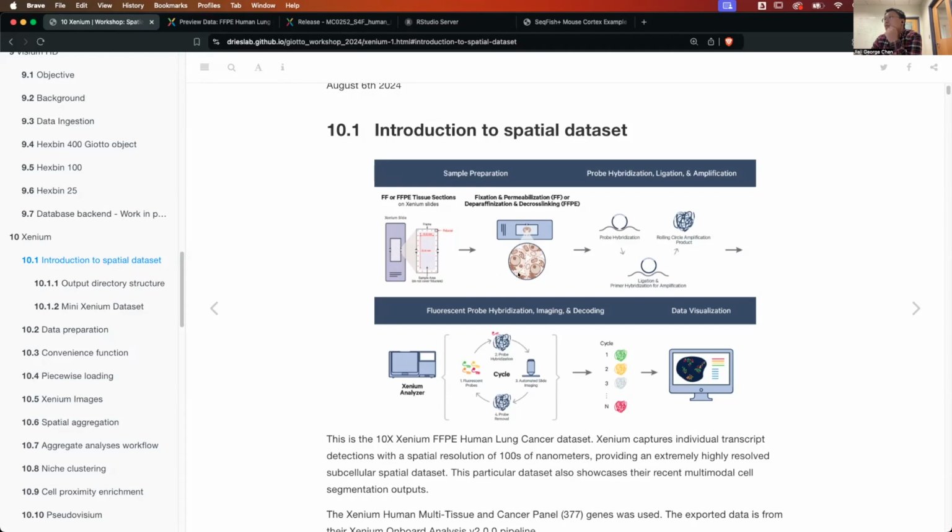So yeah, tissue placement, and then after that rolling circle amplification, it goes on the machine, you do cyclical imaging, landing these probes onto that DNA nanoball you've generated, and then it does imaging in a cyclical process so that you get different signals for every single cycle.